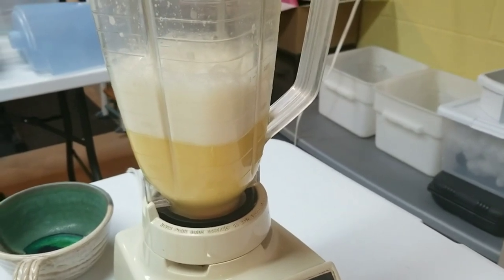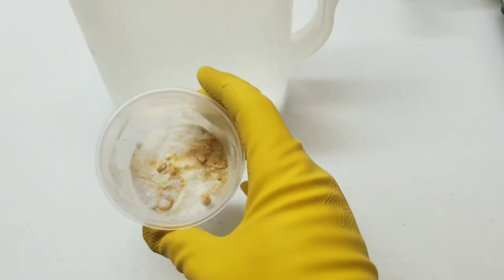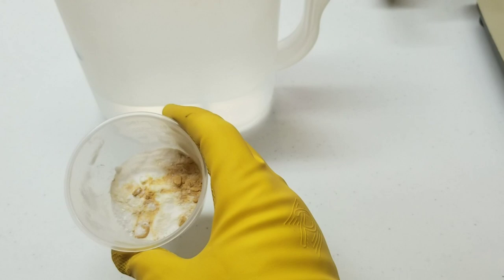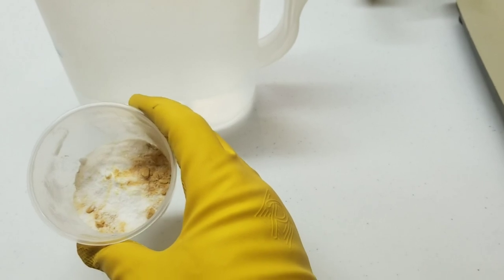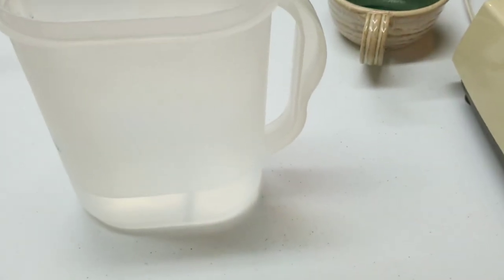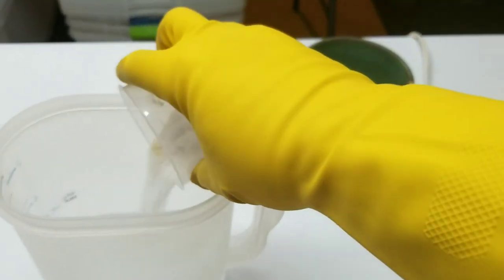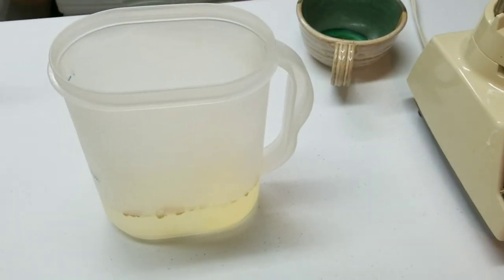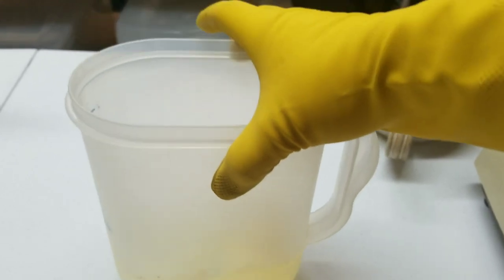Now we mix up the second nutrient broth. The dry ingredients are: 15 grams dextrose, 1.5 grams soy peptone, 1 gram monopotassium phosphate, half a gram of magnesium sulfate (which is just Epsom salts), and half a gram of ammonium citrate. All of this goes into 500 milliliters of distilled water. This is the exact recipe from the rice cooker tech video.